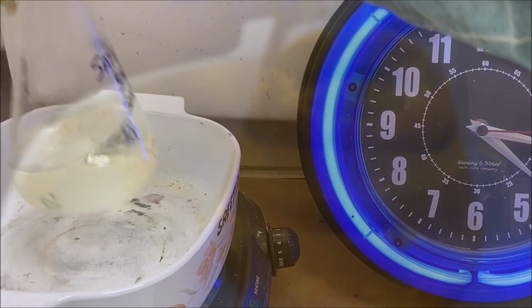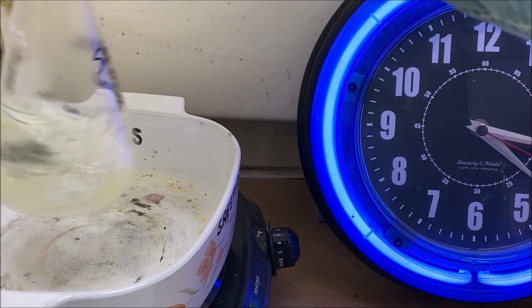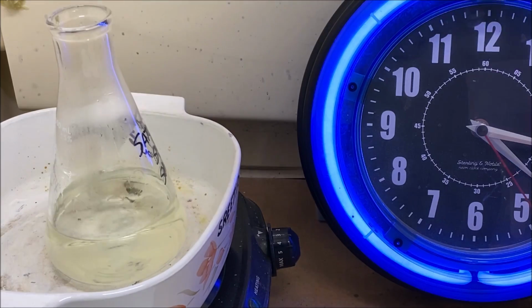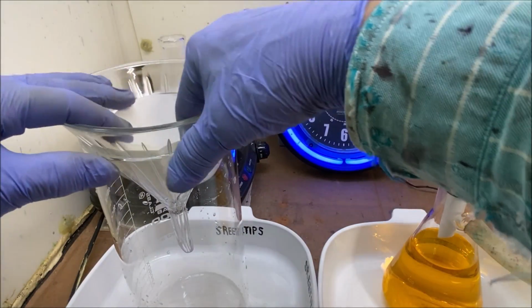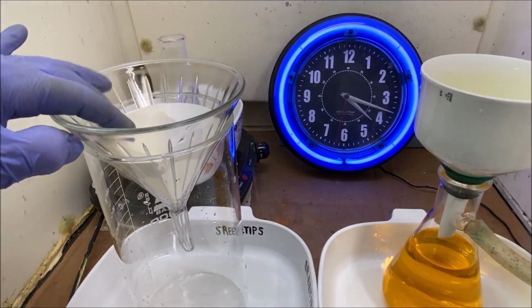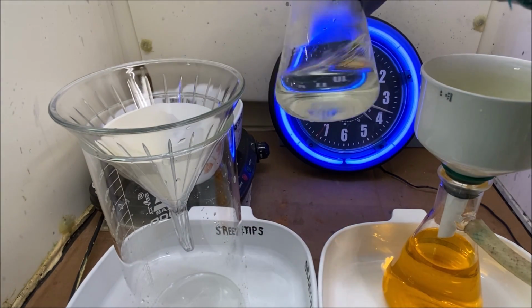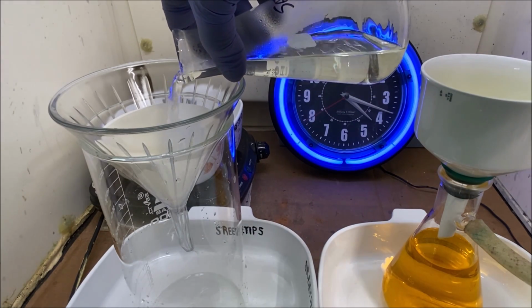I think we've got this just about totally dissolved. Just a little bit in the bottom of the flask, not much at all. All right, let's go ahead and filter this SMB solution. Got just about all of it to dissolve, not every bit of it, but we're going to pour this to a filter now.